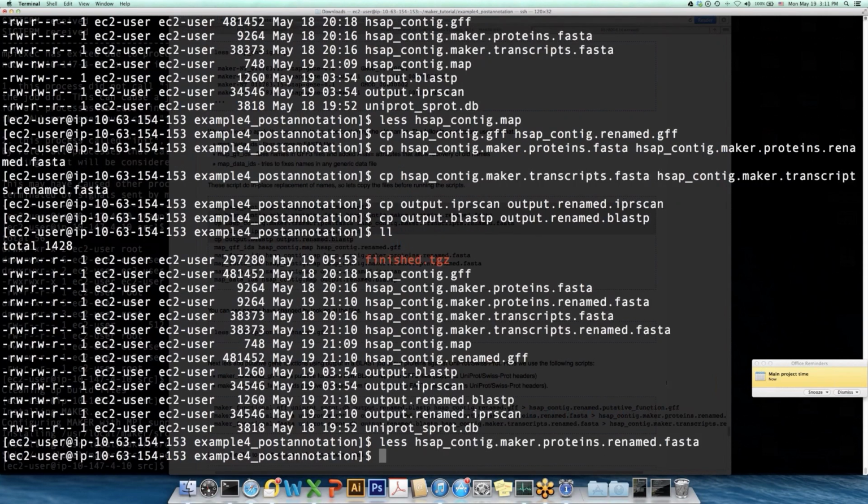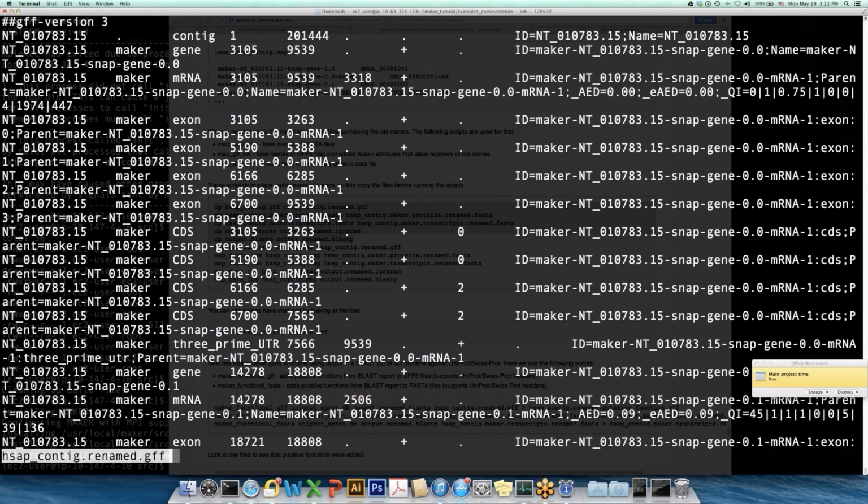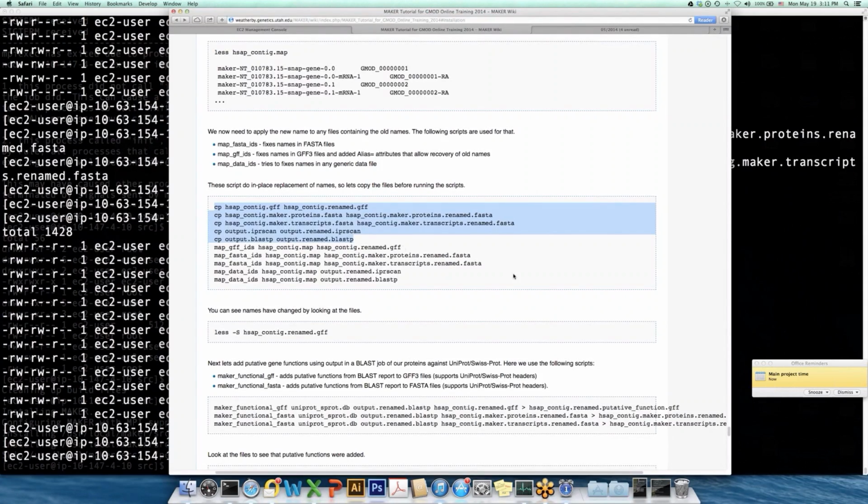Maybe one of my commands failed. Just give me a second. Okay, so all I did was the copy, sorry. So all we did was copying right now.